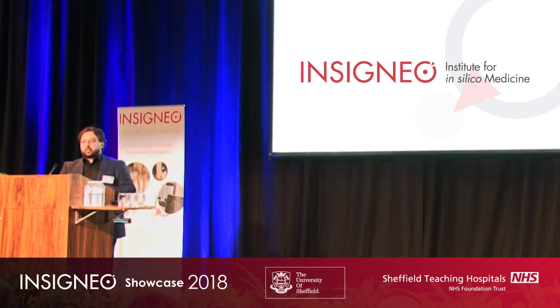The second case, in the middle, is digital image correlation. I will go very quickly through it, as Andrew already talked about it intensively. It's the same concept. We can measure the strain on the surface or on a portion of the surface. On a 3D surface, we have a stereo method, and we can do, let's say, monotonic tests, but at the same time, as a limitation, we can't measure the internal strains and deformations.